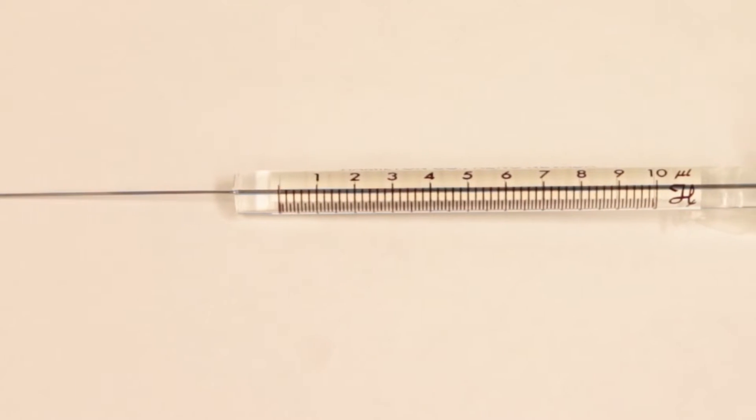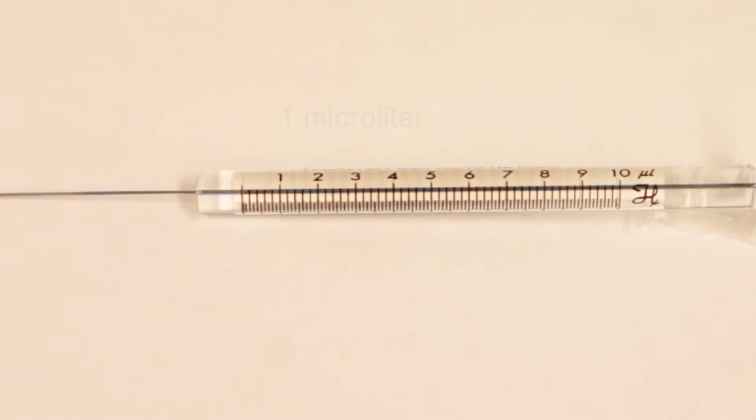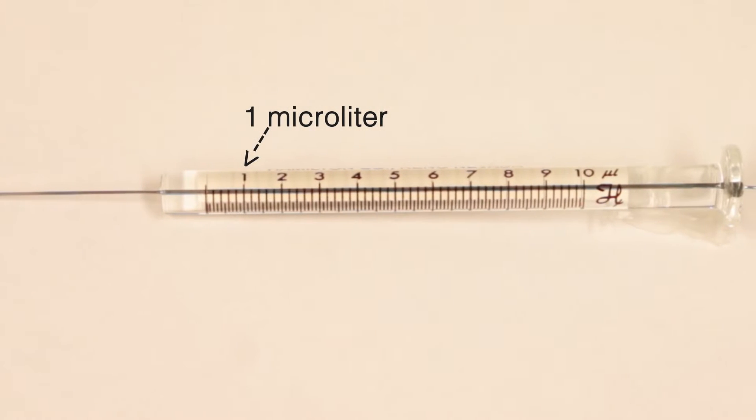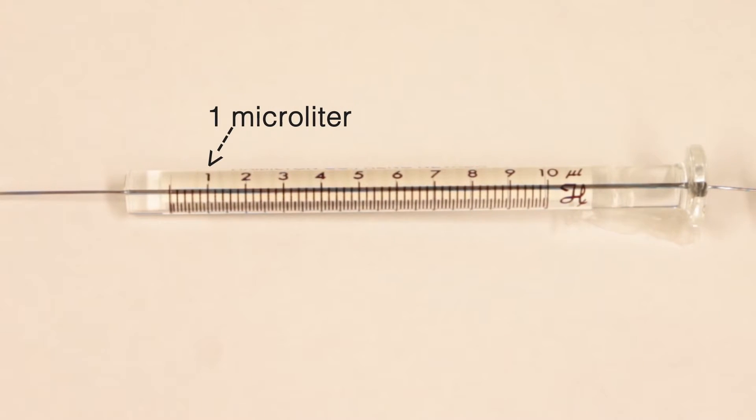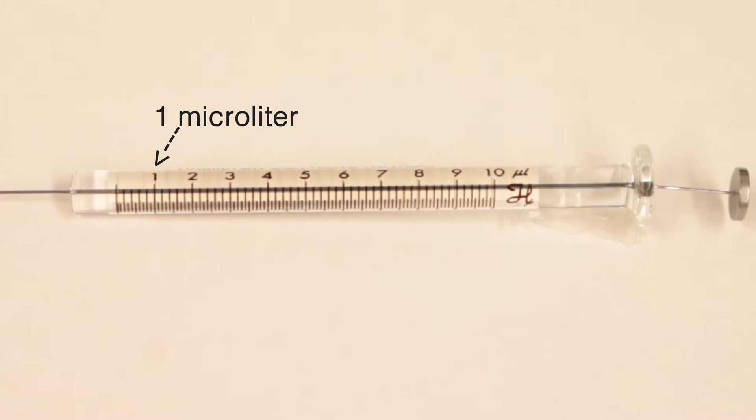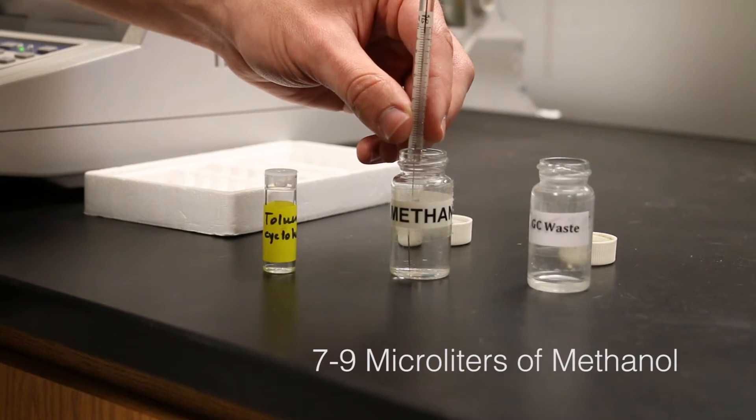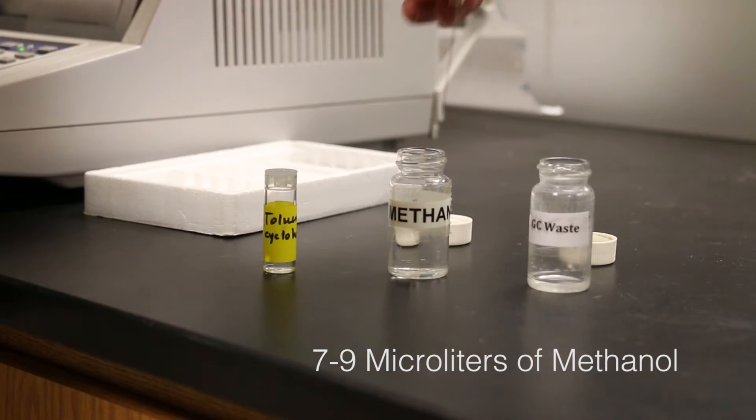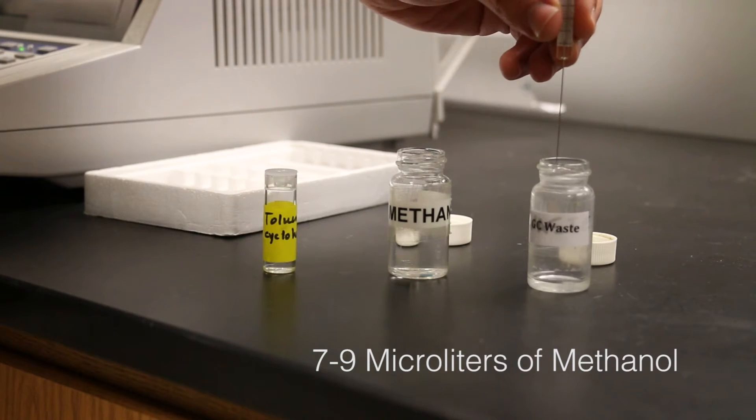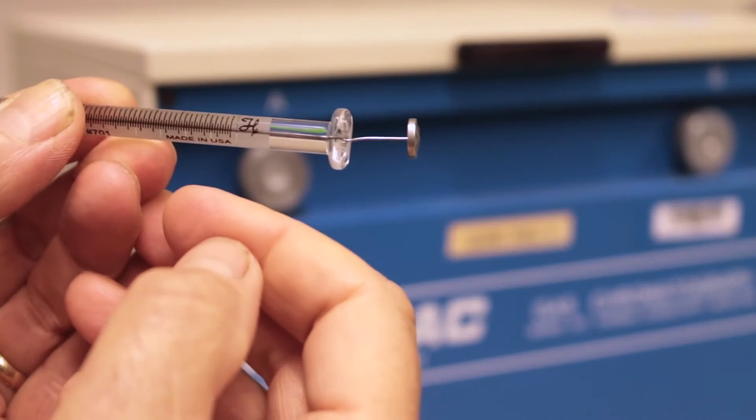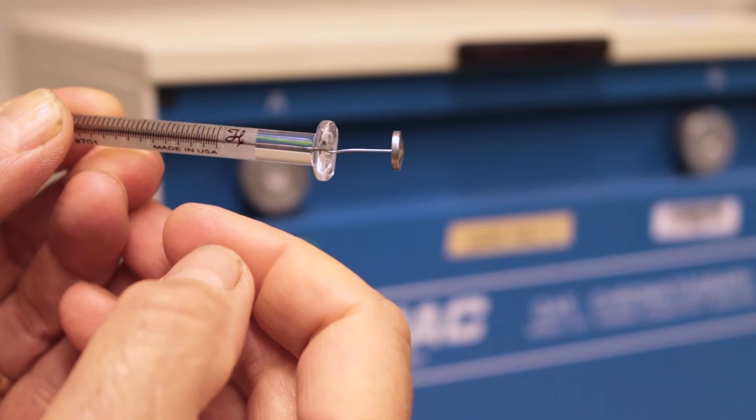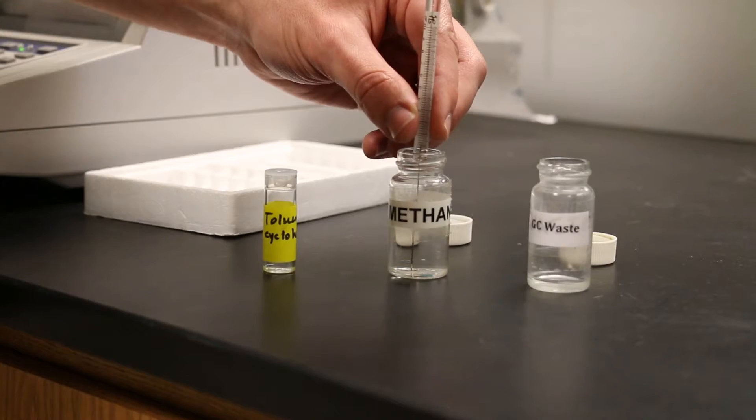In our labs, you will use a 10 microliter syringe, but you will usually inject only one microliter of your sample. Make sure the syringe is clean by first rinsing it. Rinse the syringe by pulling up 7 to 9 microliters of methanol and expelling the rinse into the waste container. Notice that the plunger of the syringe does not end up flush with the barrel when fully depressed.